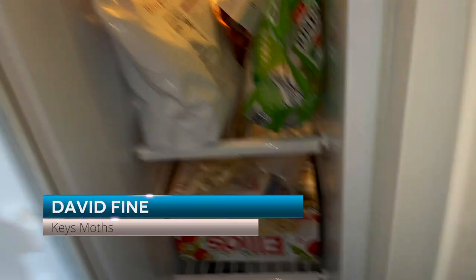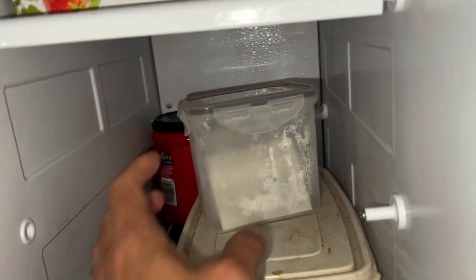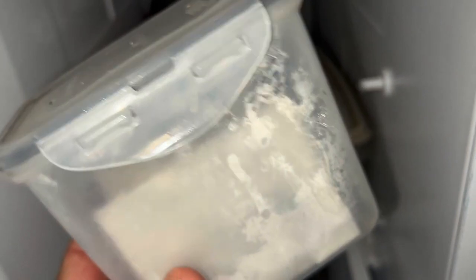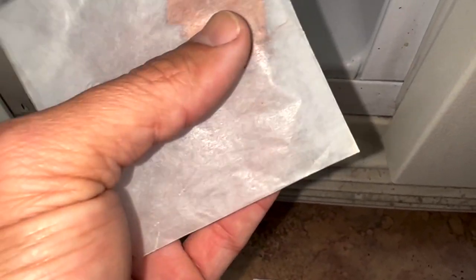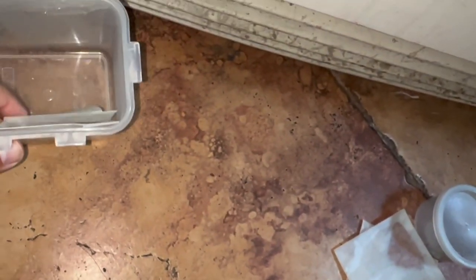Mothberg time once again, guys. We are going to open up our Tupperware container here with moths that Ricky and I took from the Keys. We have here a beautiful female IO moth that we caught. We did a video on her — she failed to lay me any eggs, which was disappointing, but we have a specimen. So we're going to mount her and see what else we got in here.